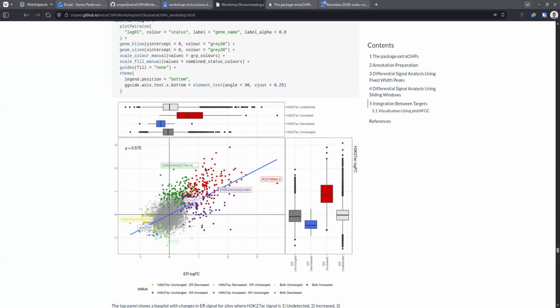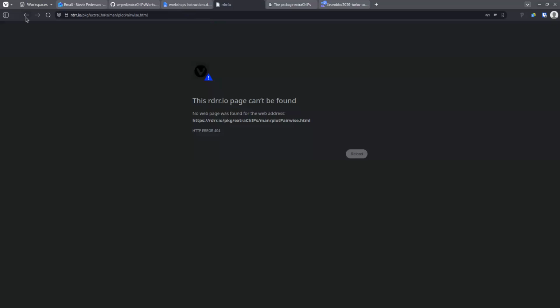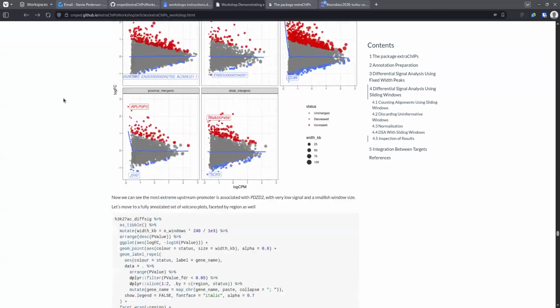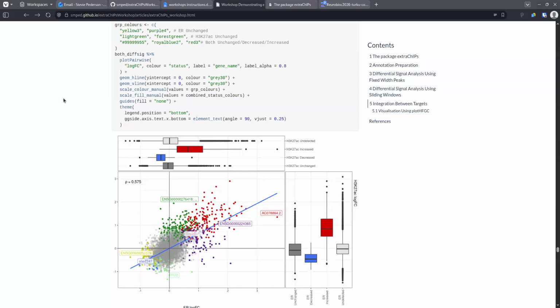And there's nothing to see there, but sometimes there is. So you get a perspective on where they are, and that was using the function plotPairwise, where you can just take a GRanges list of length 2, tell it what column to plot, and it will automatically figure out which windows, or which ranges overlap, and do the best estimate.